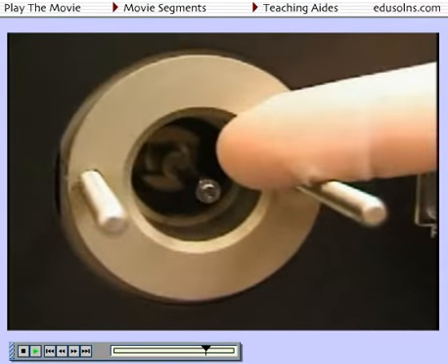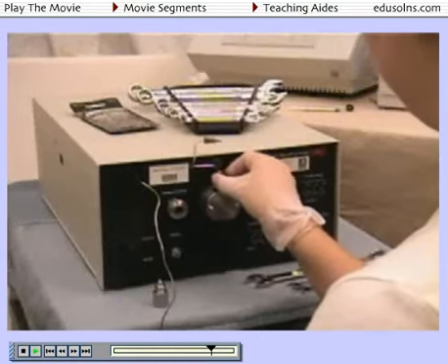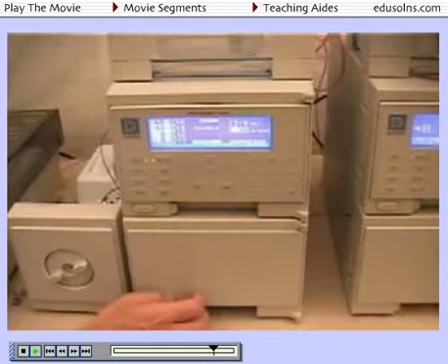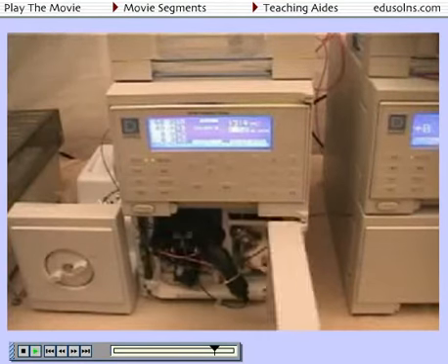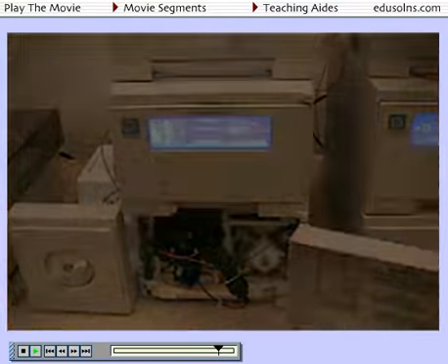After the spacer and spring are removed, you can view the piston. The spacer holds the seal that must be replaced. After replacement of the pump seal and other worn parts, the pump is reassembled in reverse order to the disassembly steps. With proper maintenance, such as filtration of all mobile phases and samples through a 0.45 micrometer filter prior to injection, pumps can last years without problems.